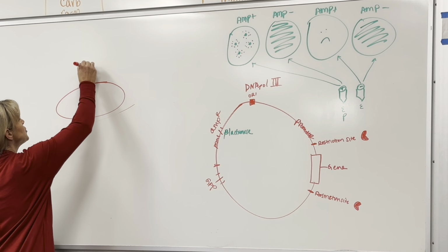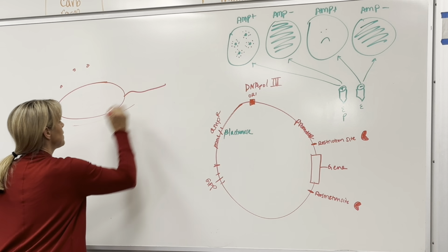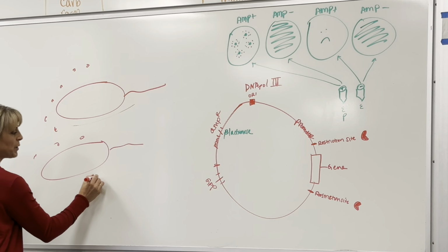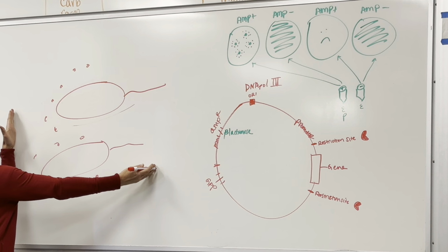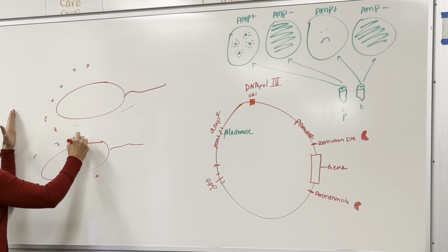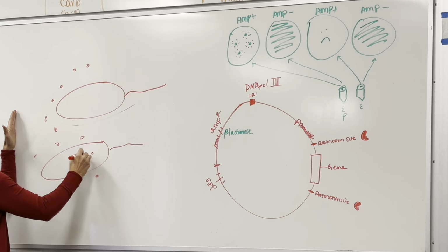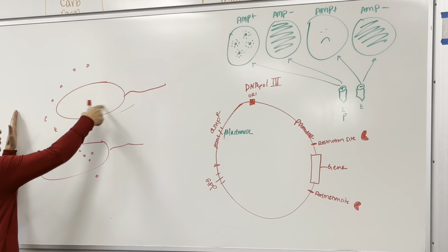We put a bunch of plasmids in the Eppendorf tube with these bacteria, all of these plasmids that we bought from the store. We put in calcium chloride so it'll get closer, then we heat shocked them. So some will take up the plasmid, and some will not.